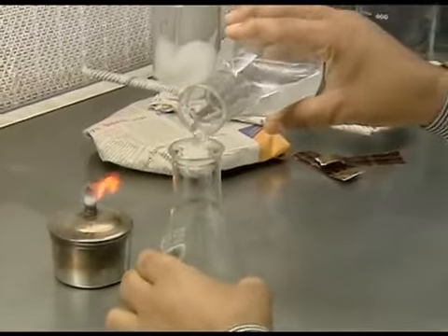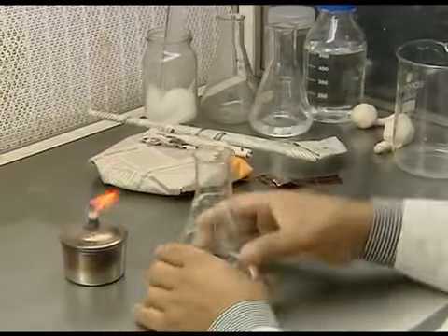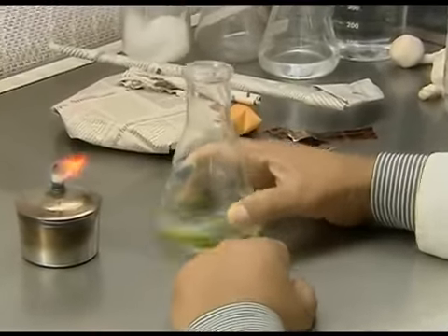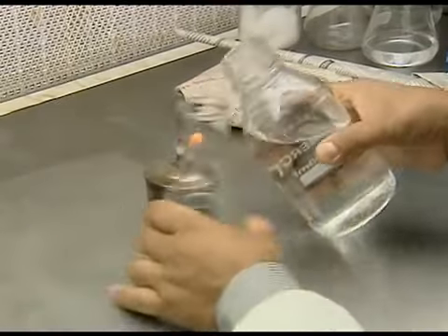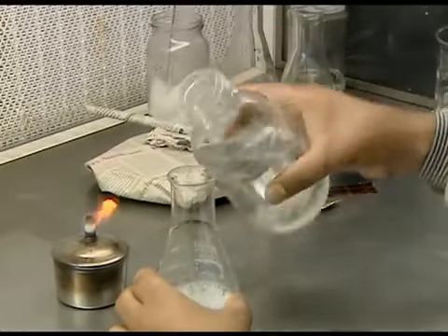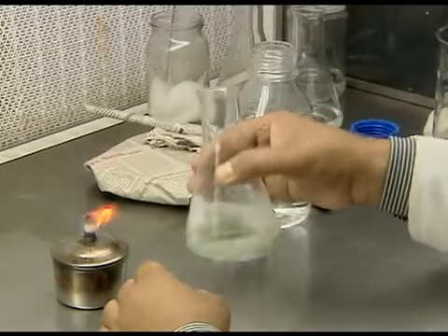The explants are washed with 70% ethanol for a few seconds and then treated with a mild mercuric chloride solution for a few minutes. A general thumb rule is to use a mild solution for a longer duration rather than a strong solution for a shorter duration.